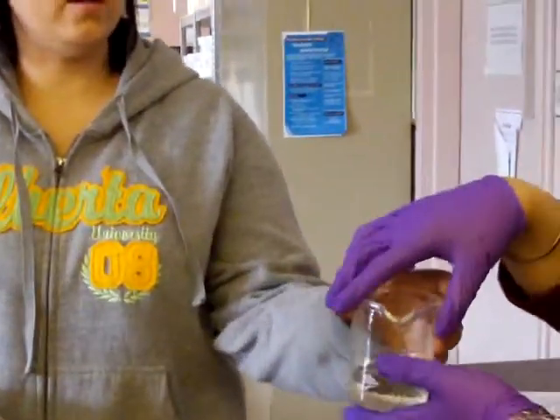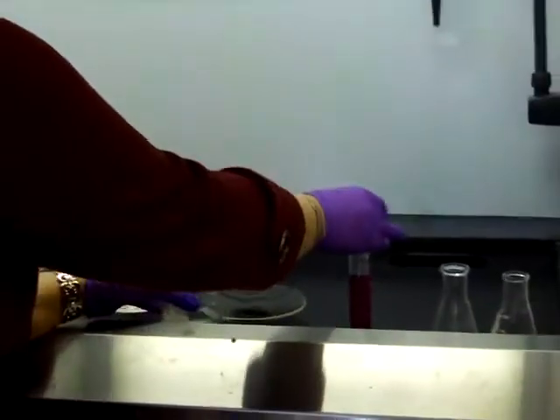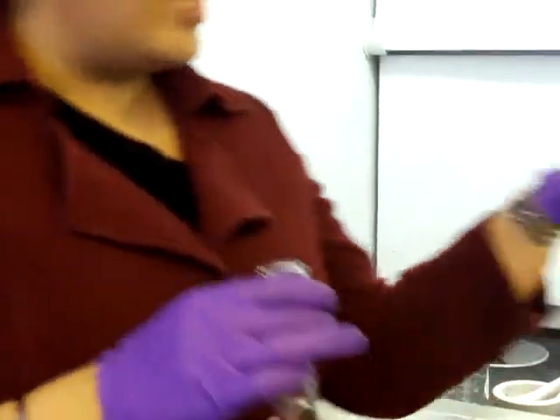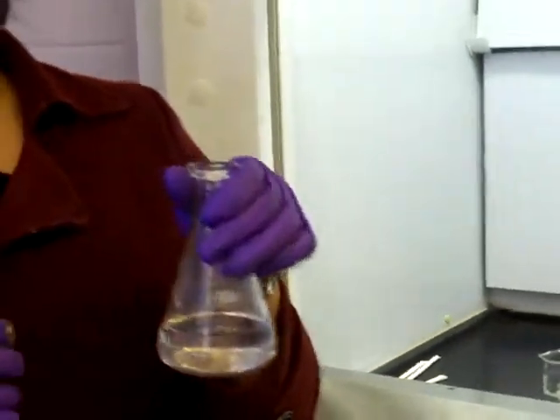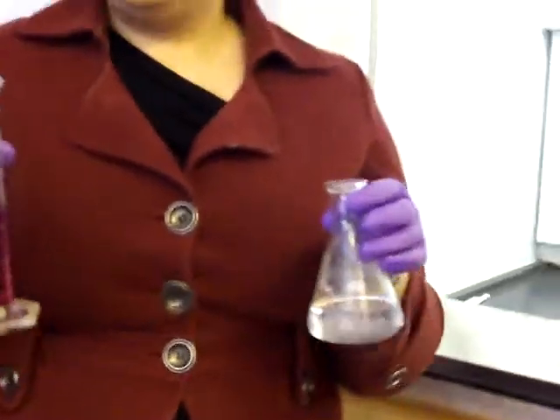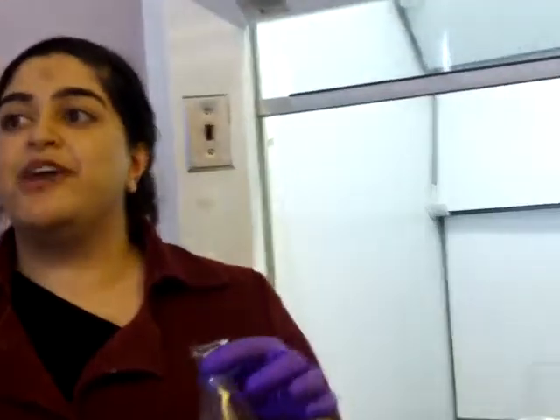Yeah, so before everything was at room temperature, I just created it before to save time. And here I have a solution, it's just water and a little bit of potassium permanganate. In here I have a little bit of sodium hydroxide and some sugar and water. What do you think will happen when I combine them? So what's in that? Potassium permanganate and sodium hydroxide.